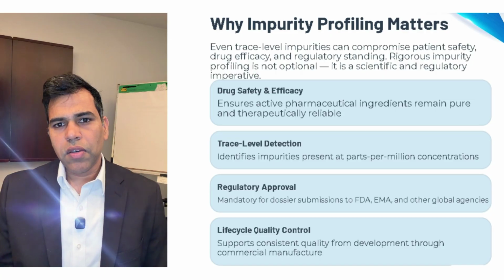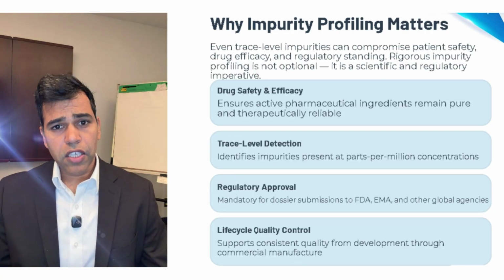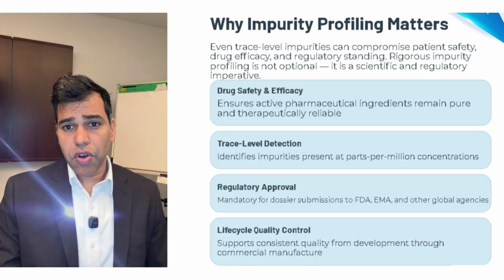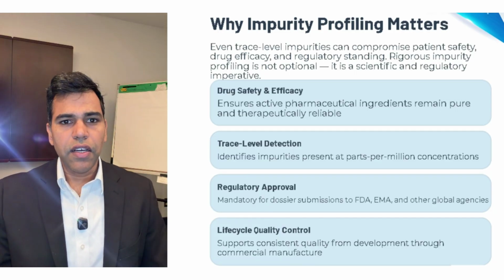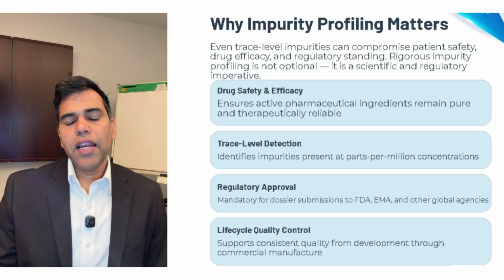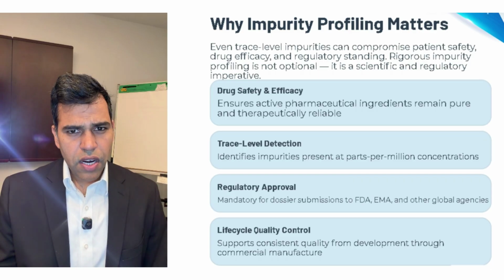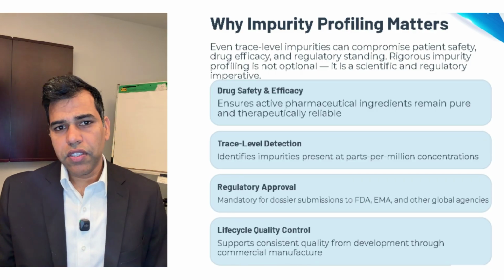We are talking about impurities at parts per million and sometimes parts per billion concentrations, levels that seem trivial on paper but can compromise drug safety, efficacy, and your entire regulatory submission in one go. Whether you are filing with the FDA, EMA, or any other global agency, your dossier lives or dies on the quality of your impurity data.